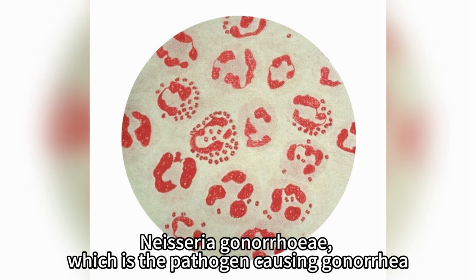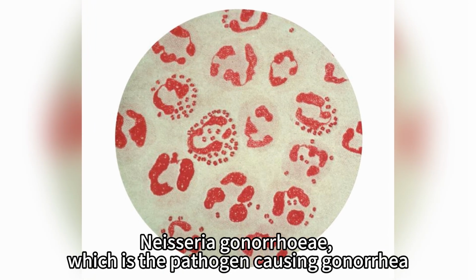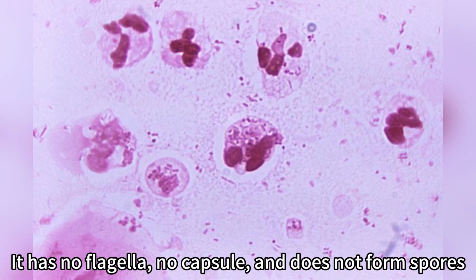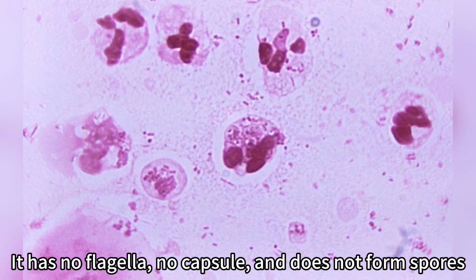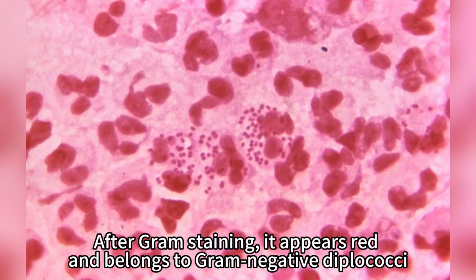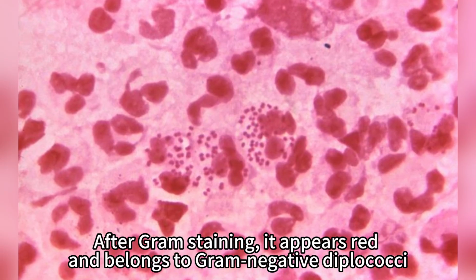Neisseria gonorrhoeae, which is the pathogen causing gonorrhea. It is kidney-shaped under a biological microscope. It has no flagella, no capsule, and does not form spores. After gram staining, it appears red and belongs to gram-negative diplococci.